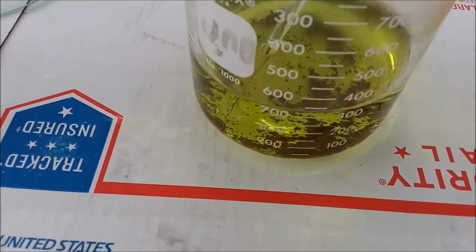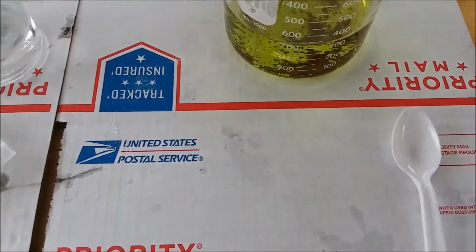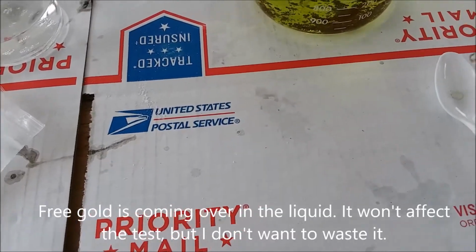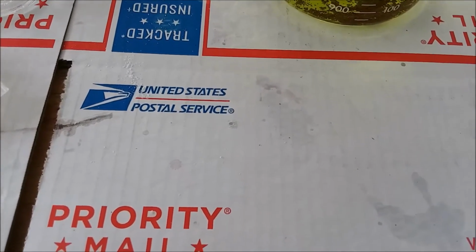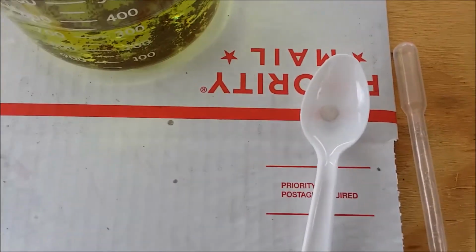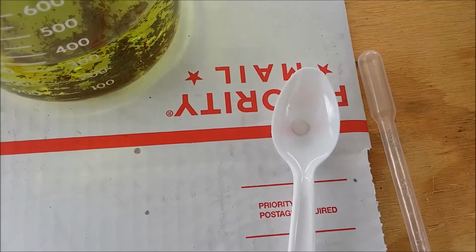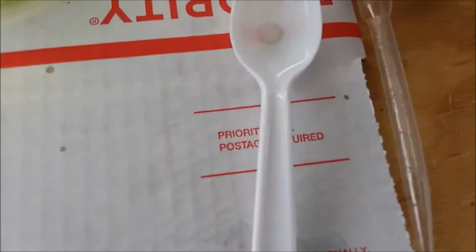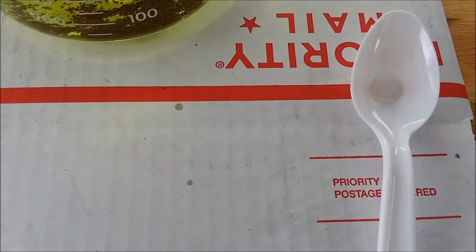Let me do a stannous chloride test to make sure I got all the gold out. Otherwise, I'll have to put some more sodium metabisulfite in. So I got a clean white spoon here. Get a little of the liquid. Ooh, I can see some gold in the liquid. Yeah, okay. Maybe this isn't the best idea. Hold on a second. Okay, I guess I can't get any liquid out of there that's not going to have some gold on it. There's still some gold suspended in the solution. There's gold floating on top of it. And so it's hard for me to get any liquid out that doesn't have a little bit of gold in it. But we'll see if there's a color change in the solution once I add the stannous chloride to it. It doesn't look like it. It looks like it's staying clear.